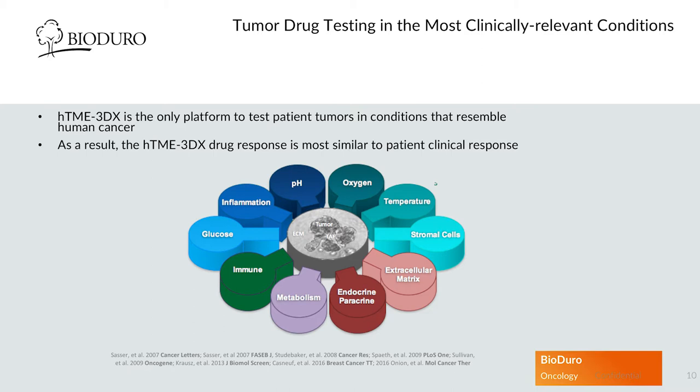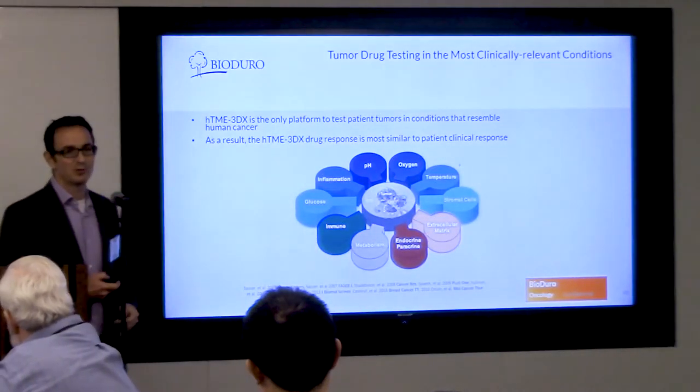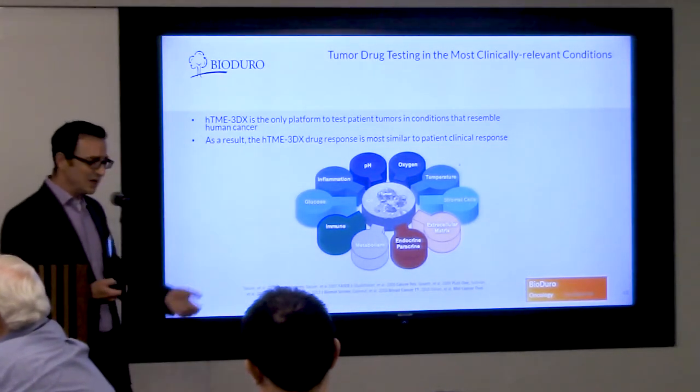possible. We will adjust things like pH, for example. In tumors, you have an effect which is well documented, it's been known for many, many years, as the Warburg effect, where the pH of that tumor is actually acidic, right? So why would we grow our tumors in our cell culture systems at a neutral or non-acidic pH? It's a simple thing, but it's something that most people don't do. We do it. And similarly, you can look at a lot of these parameters here, whether it's glucose levels or oxygen tensions or the matrix itself.